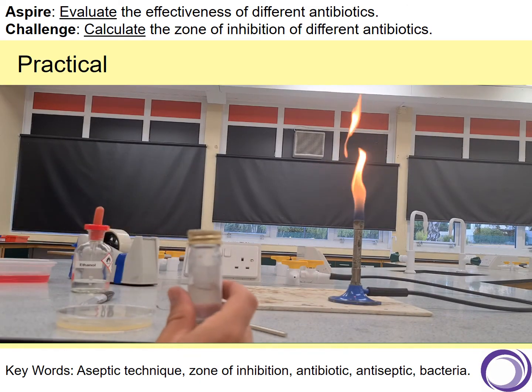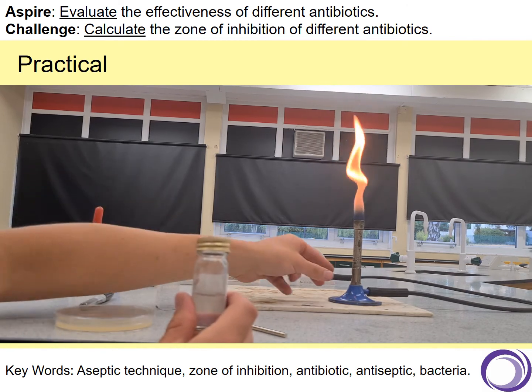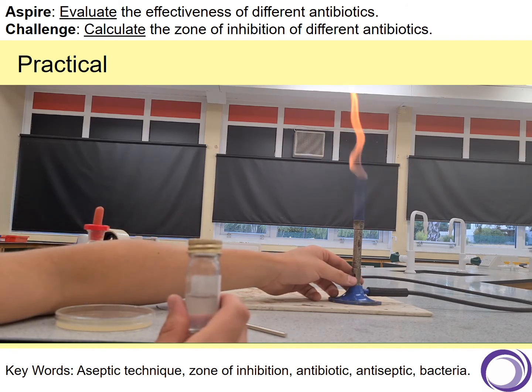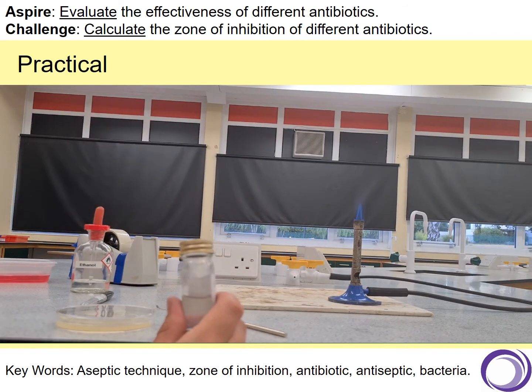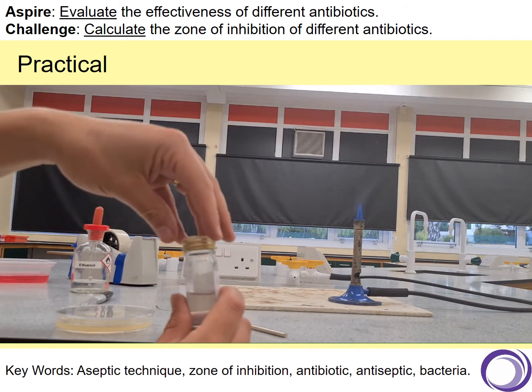This isn't easy to do with one person, so forgive me if some of this doesn't quite work. I'm going to turn this onto a roaring flame. I know you probably can't see that through the camera, but it's on. It's just very, very hot now.